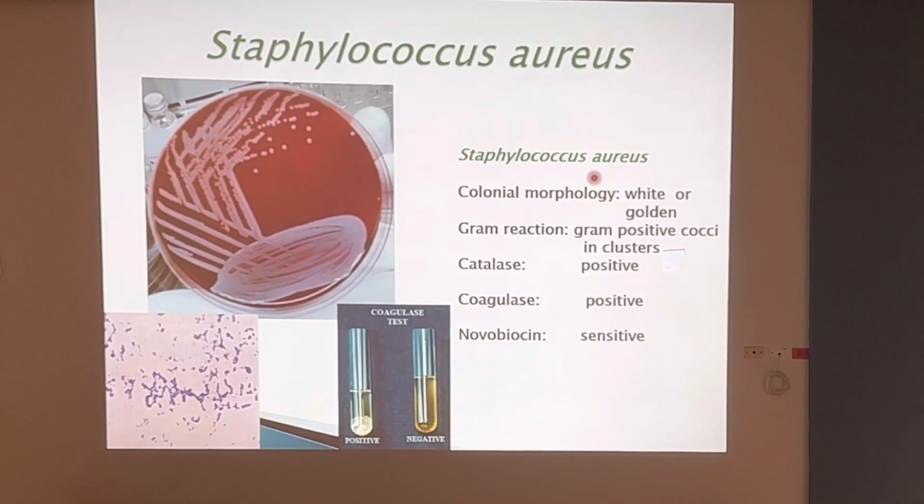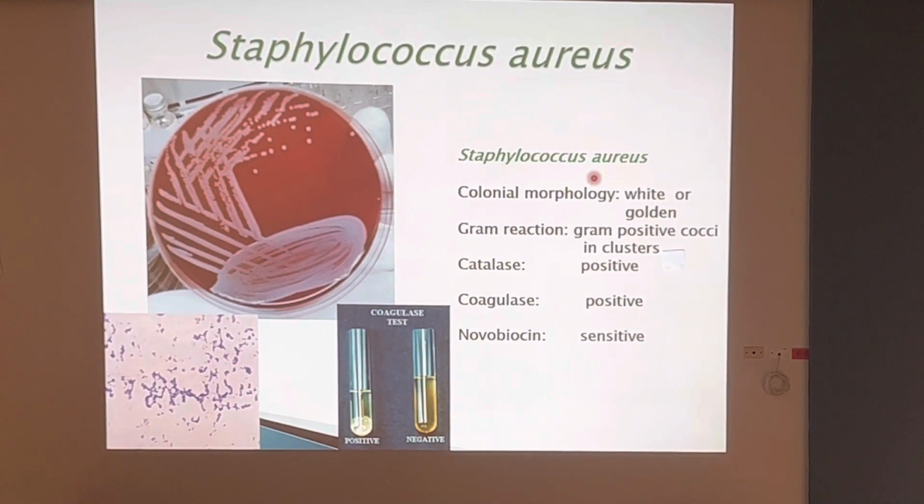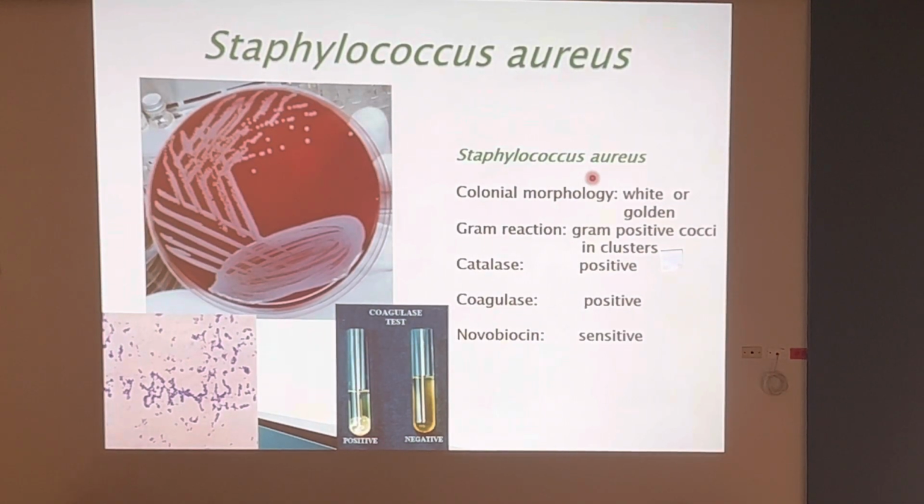I do my coagulase test. The coagulase test is positive, and Staphylococcus aureus is the only one of these 3 that is coagulase positive. The other 2 are coagulase negative. If I want to identify the other 2, I have to do further tests.